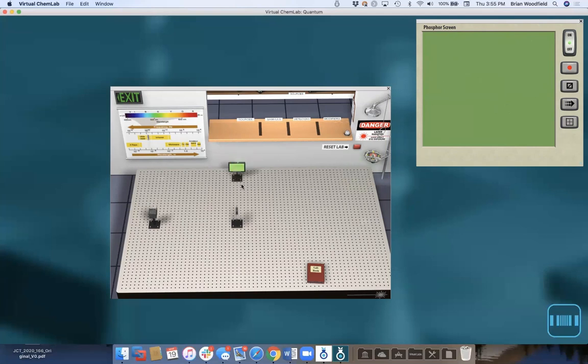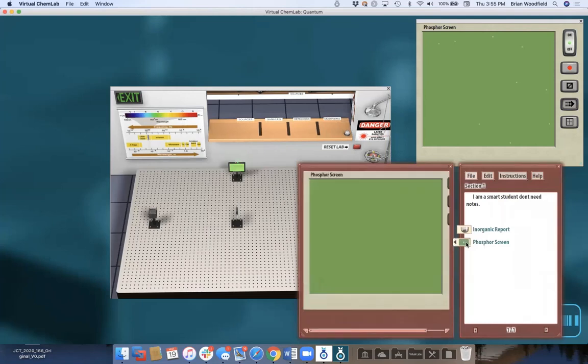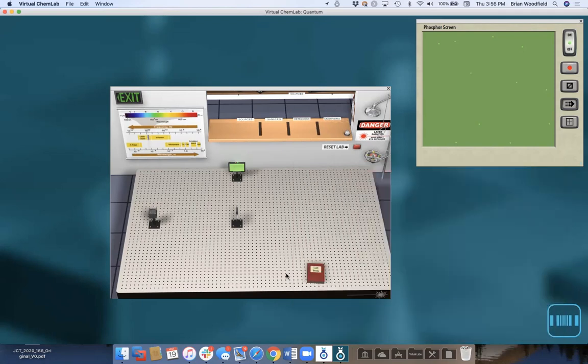Now move it right here. And so you click the persist button here and you can see where they're at. And I can click save and save this experiment to my lab book. So if I open my lab book, you'll see here is that same experiment that's being done. And so you're able to go through this and step them through what's going on in this experiment.